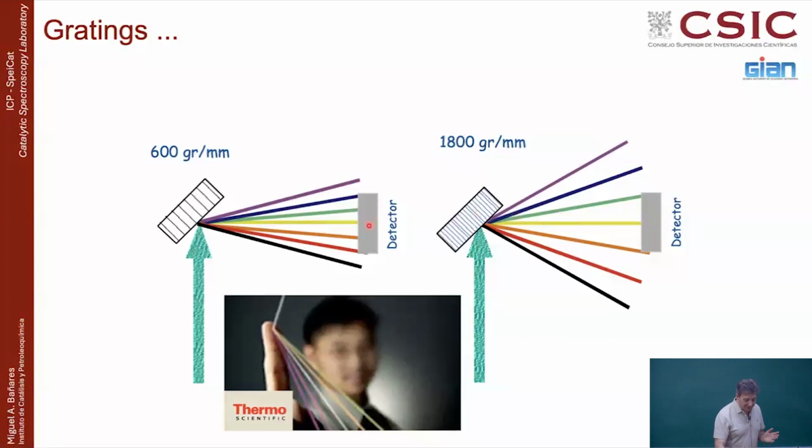So basically, how does a spectrometer work? You will buy a system that has probably several gratings, like 1800 grooves per millimeter is a typical one. But what happens is that the detectors have a given size, they're pretty much standard. So it's either you see this part, or you see this part. So basically, the grating will move so that you select which part you are looking at.